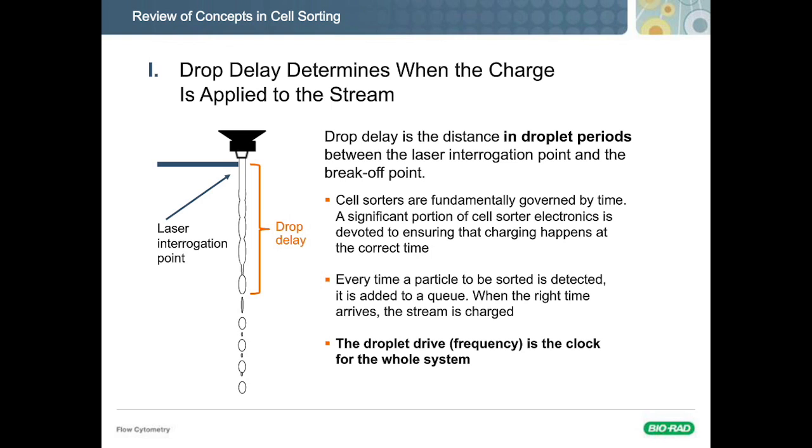And there's a lot of work over the years that has gone into measuring that, everything from microscope slides to some of the new automated systems, like the S3, that directly measure it, and other systems that estimate it. But that time is a tremendously critical factor in cell sorting because for every percentage you're off, you start to lose that much in your cells. And everything is based in terms of the original drop drive.